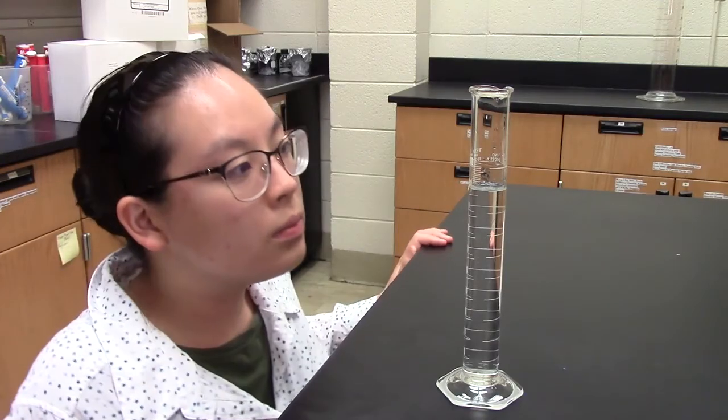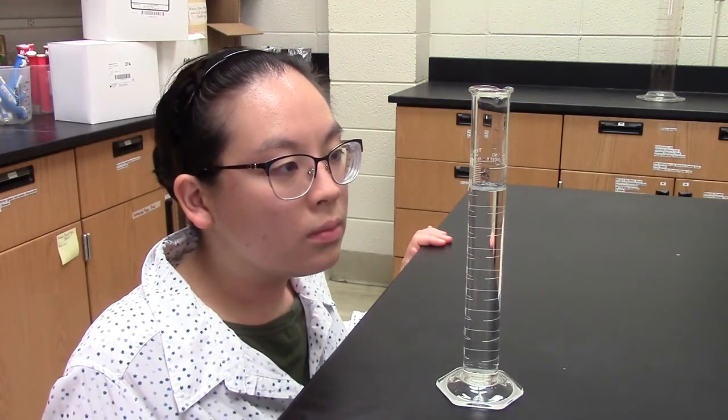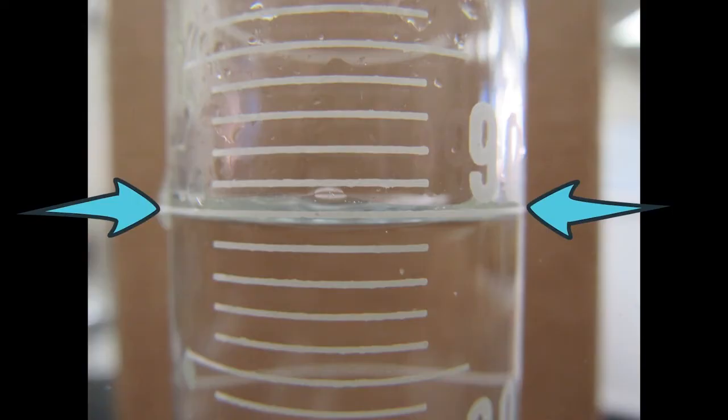When you're looking at the amount of liquid in a graduated cylinder, be sure you are at eye level with the cylinder and that you base your measurement at the bottom of the meniscus. The meniscus is a slight curvature at the top of the water column that forms as a result of the water sticking to the sides of the graduated cylinder. It's important to always read the volume of water from the bottom of the meniscus.